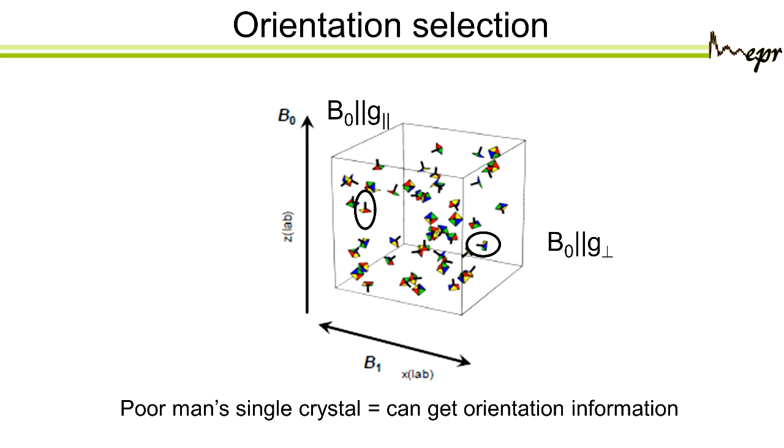When we did a single crystal, it was always a single orientation. But now there are places in the spectrum that are single-crystal-like, some more, but I still have orientational information. So this type of measurement really gives you the information on the relative orientations of the g and the hyperfine, which gives you the orientation of where your nucleus is. So you have to collect this series of measurements. So let's see an example now.